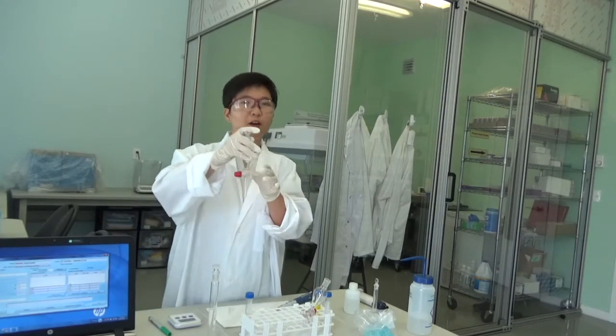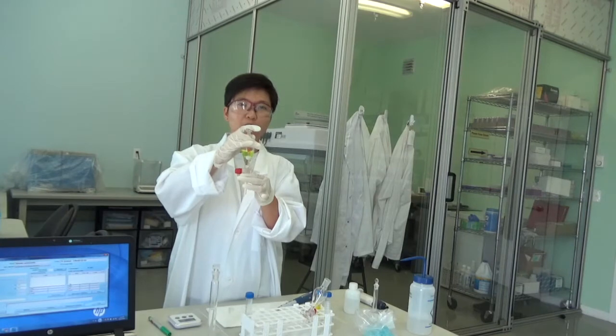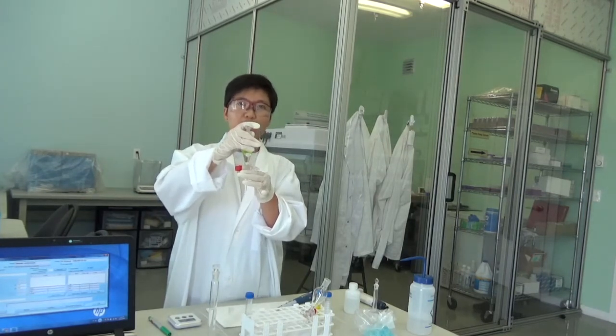So now we have 5 ml of sample, 4 ml of water, 1 ml of acridine yellow, 1 ml of hydrochloric acid, and 5 ml of chloroform in the mixture.